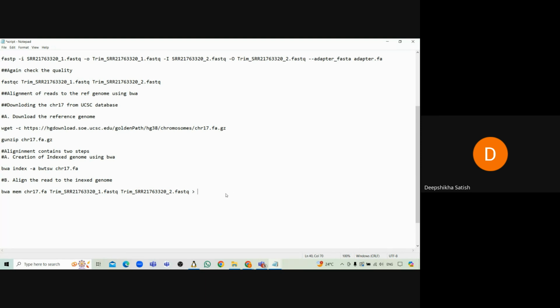And then it is going to give you the output file. So I'm giving a prefix BWA just to understand it, then I'm giving the ID, and the extension I'm giving here is BAM. So it is going to generate the BAM file. You remember what a BAM file is? It's a binary alignment map format.